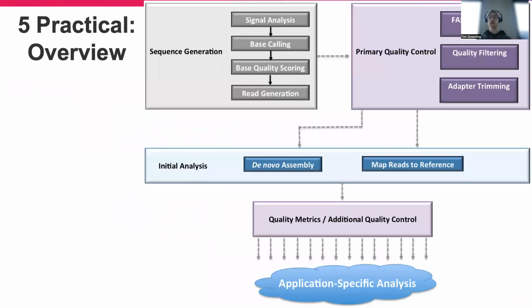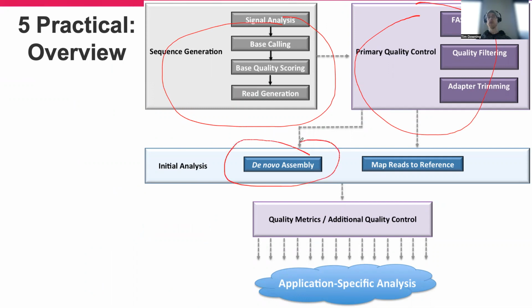Another way of looking at it is in this graph: we had our sequencing data initially generated, and we did the QC part in the last practical. Here we're doing de novo assembly in G03. We'll do remapping, and then we'll look at variant calling in G04. So that's how our courses link together.